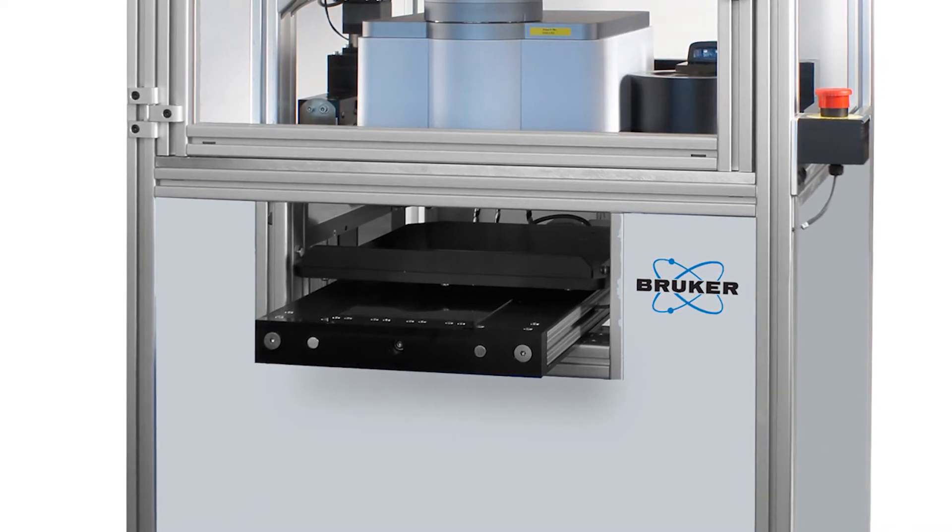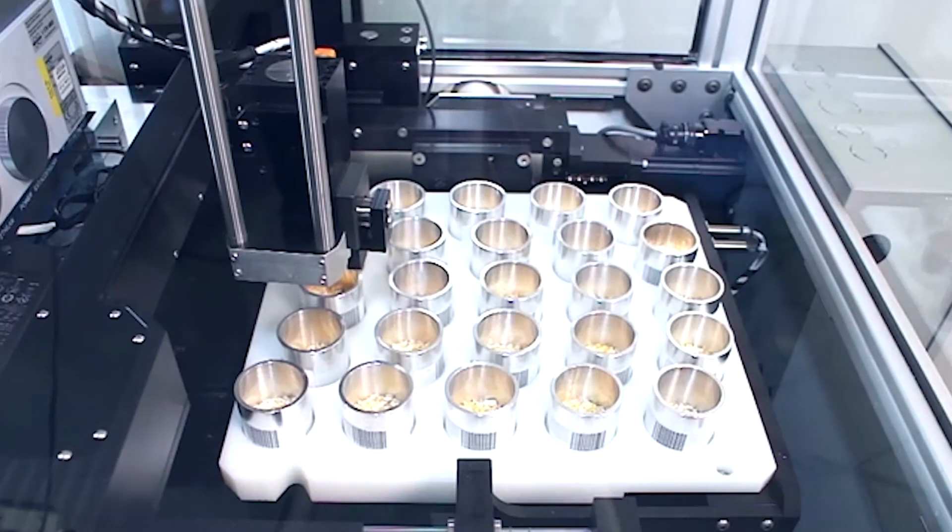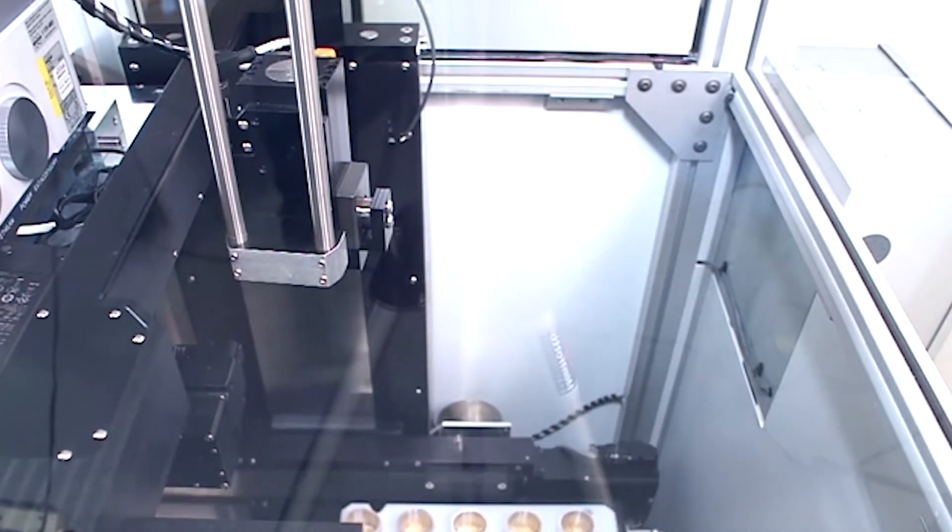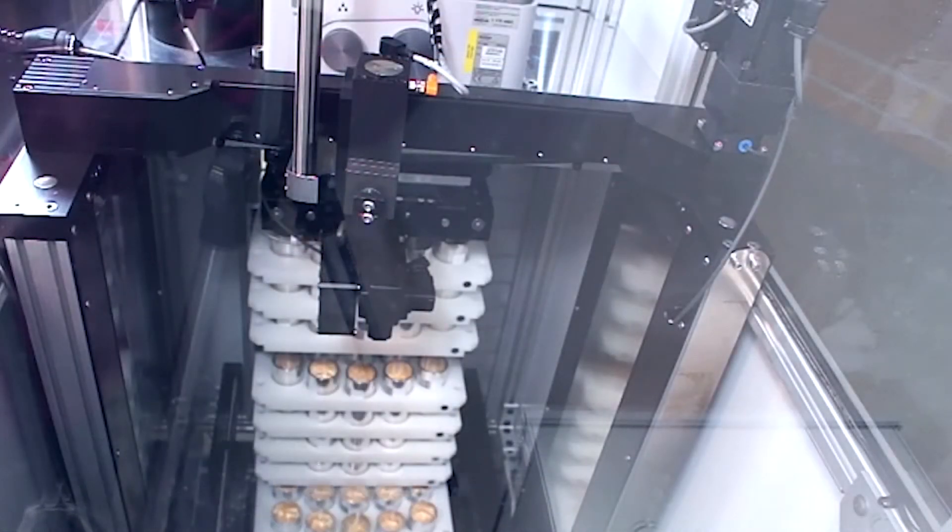The advanced version adds an automated tray loader to the basic configuration. The loader extends the tray holder on receipt of the load tray command. When the tray with sample cups is placed on the tray holder, the sample tray is pulled into the Auto Sampler and stored in the first available storage slot.